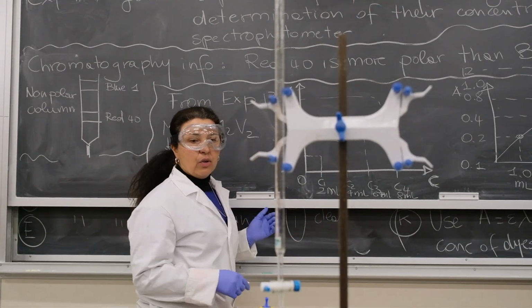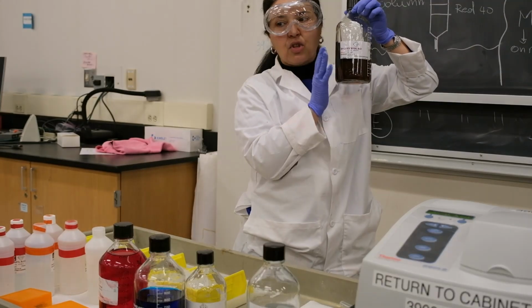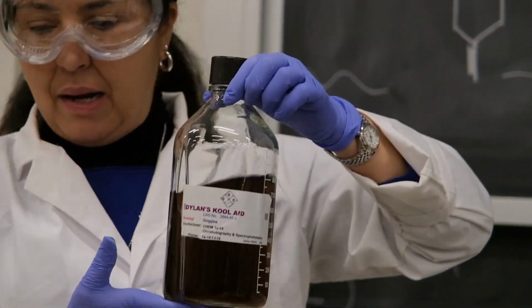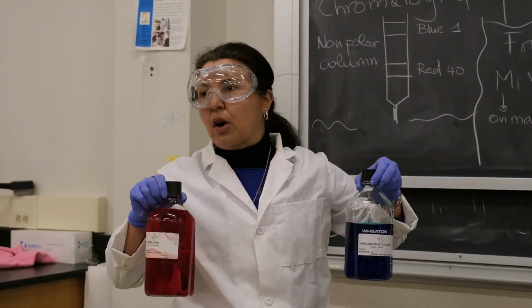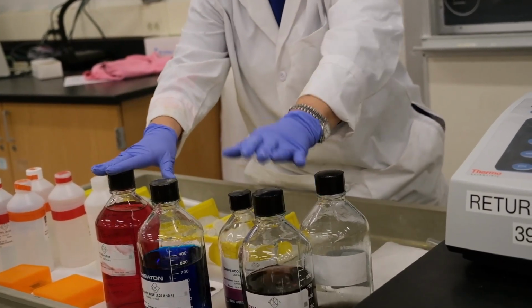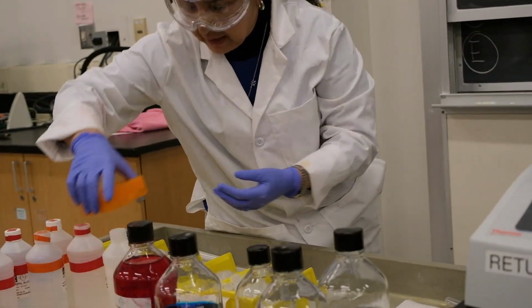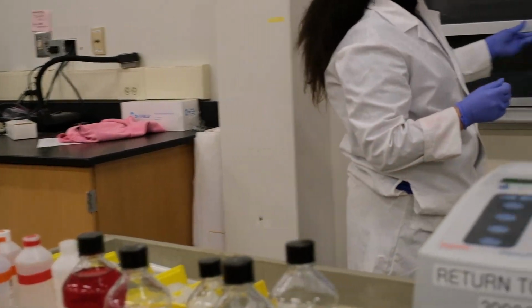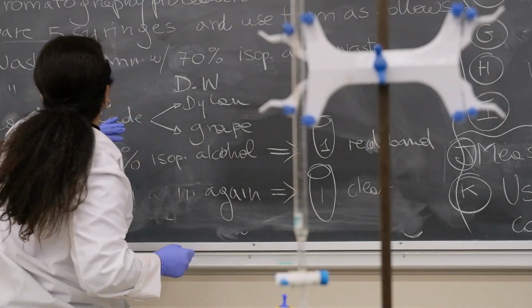And then you're going to perform the separation from this solution that contains the mixture of the Allura Red and the Brilliant Blue. You're going to separate your mixture into 2 solutions using chromatography. So here you have the mixture of these 2. You need to separate them and find out what is the concentration. How do you do that? Let's see how. So chromatography is one of the techniques that we studied at the beginning of the semester when we were working on purification processes.